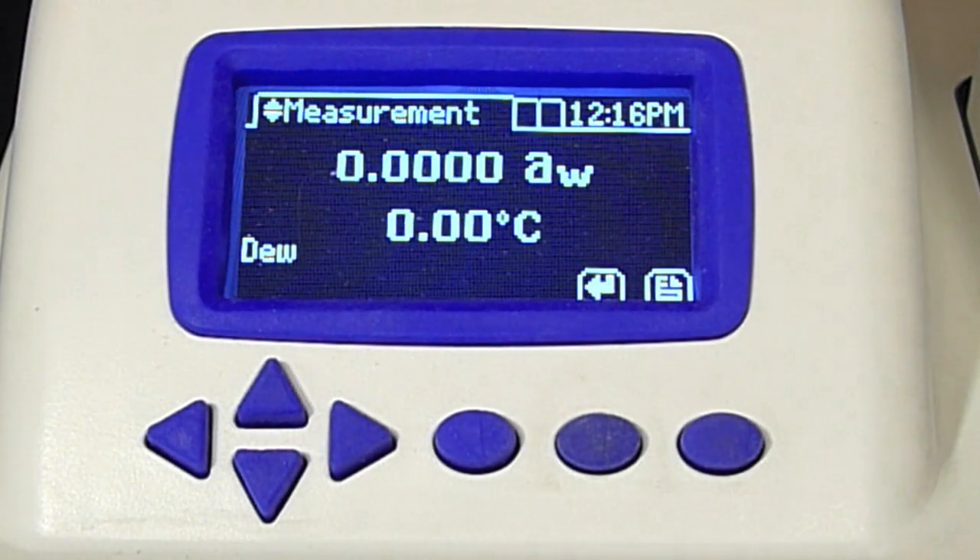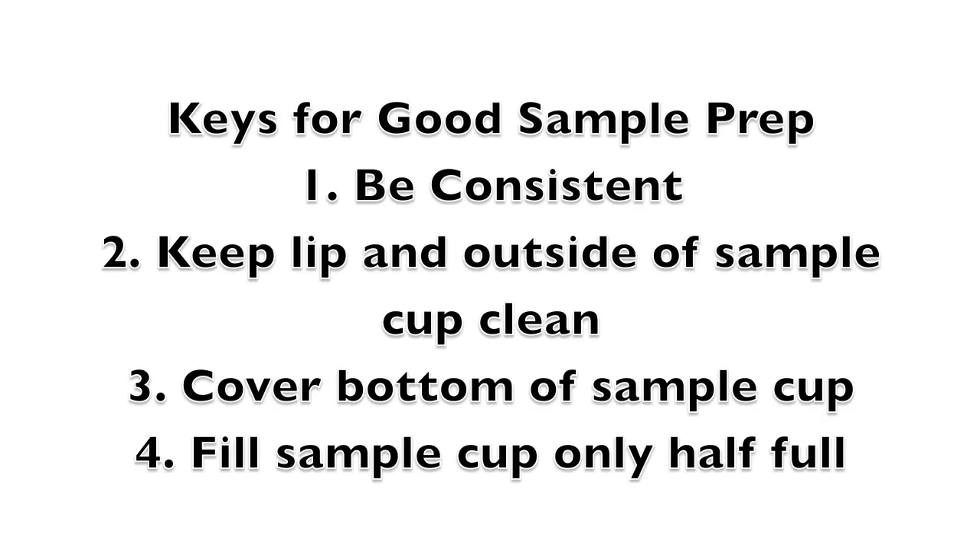While the Series 4 warms up, let's prepare a sample. Let's start by reviewing four keys to good sample preparation. First, be consistent. Doing the same thing every time will ensure that you get more repeatable results.